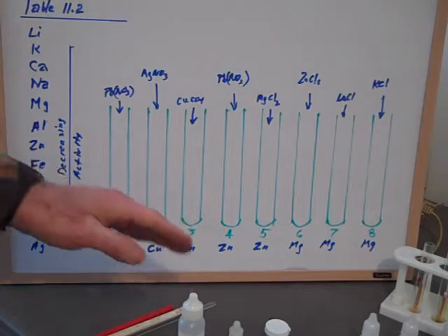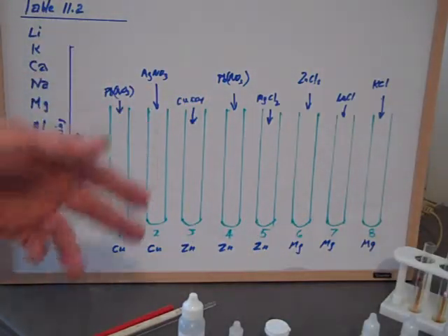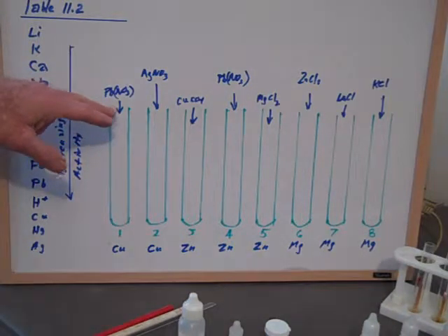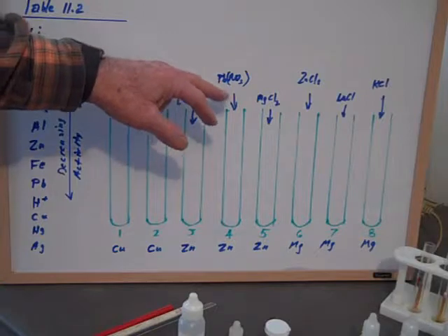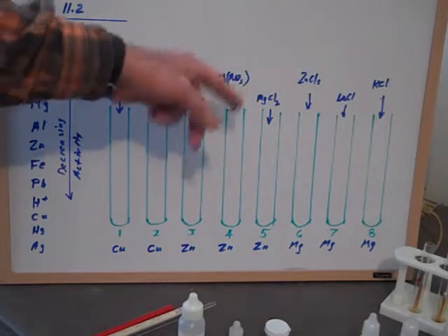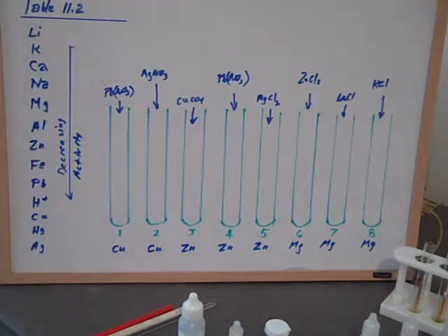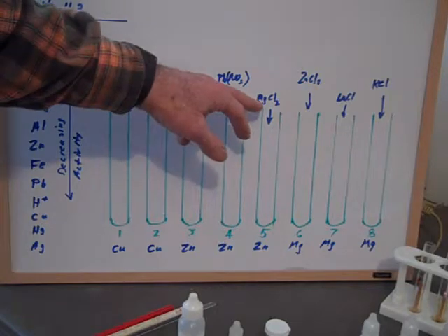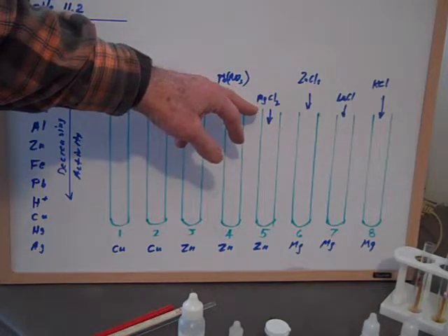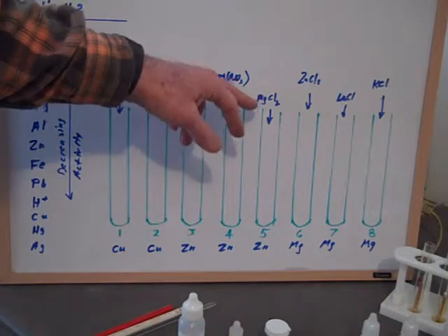First of all, we have all of the chemicals we're told to mix into the test tubes with the strips listed right here. Lead nitrate, silver nitrate, copper sulfate, lead nitrate again, magnesium chloride. And we didn't have magnesium chloride. It's a common salt. It's found lots of times in pellets for salting your walk or driveway. So we're using magnesium sulfate as a substitute. That really shouldn't change anything. We just want to see how the magnesium ions behave.